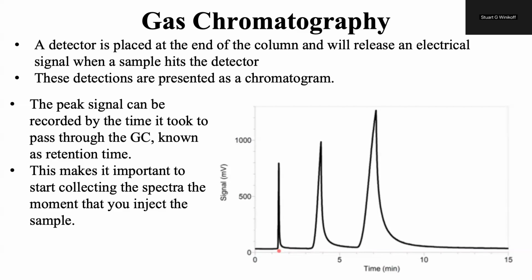This often means that this can take 3 hands. So if you need to work with somebody else, where you inject the sample while they hit the start button, that works just fine. And again, full details of how to do sample injection and runs are present in your lab manual, and I'll be going over some of the highlights in lab.